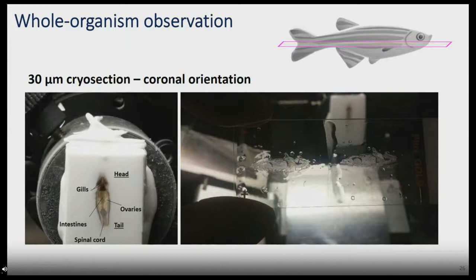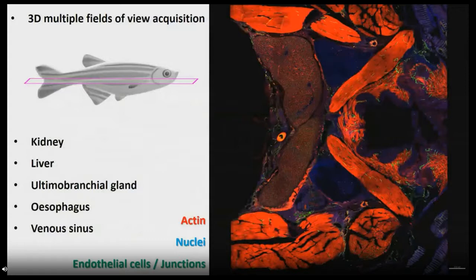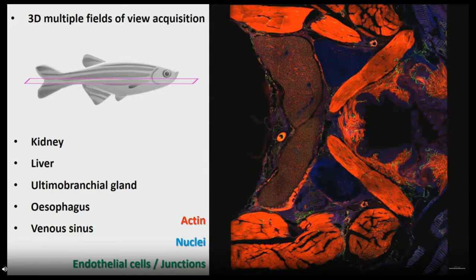For whole-organism observations it's more about the adult zebrafish. What I do for my research is make cryo-sections through the length of the zebrafish — here a coronal section — where everything is preserved: ovaries, intestines, gills, tail, heart. You can then apply different stainings, such as phalloidin to reveal actin and DAPI for nuclei. Those two stains alone give a lot of information to identify which tissue and cell type you are looking at. In this acquisition, the endothelial cells, blood vessels, and lymphatic vessels are shown in green fluorescence, and you can navigate from multiple fields of view to identify the kidneys, tubules, and other structures.